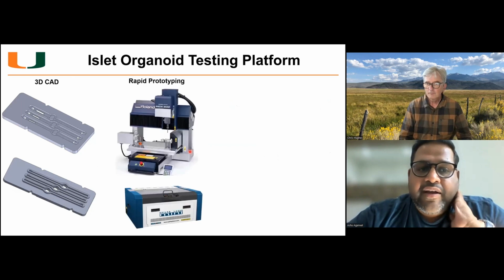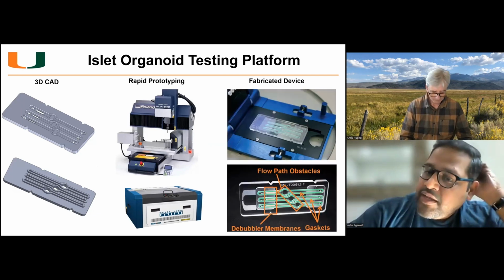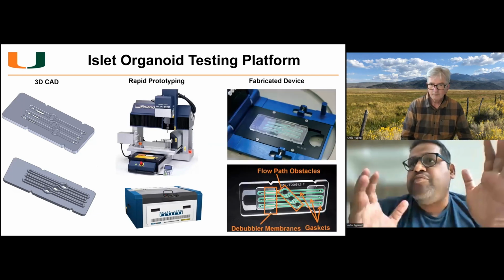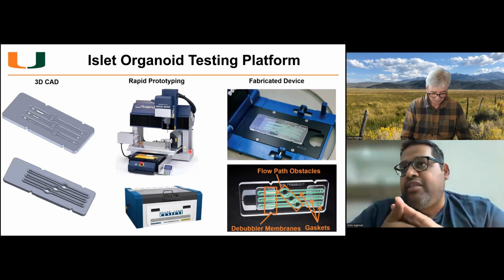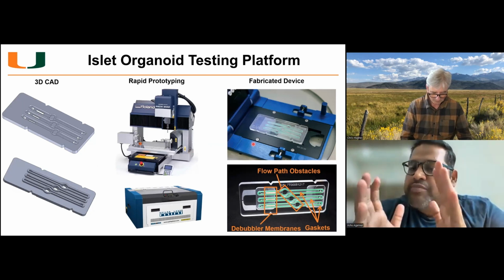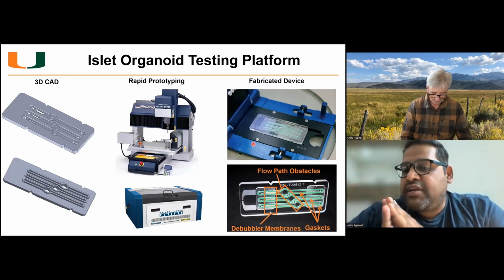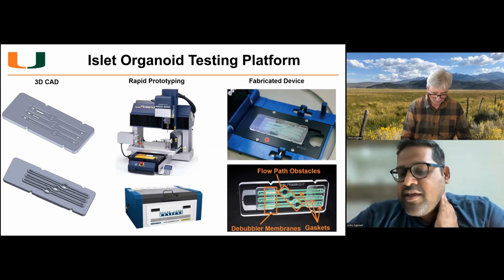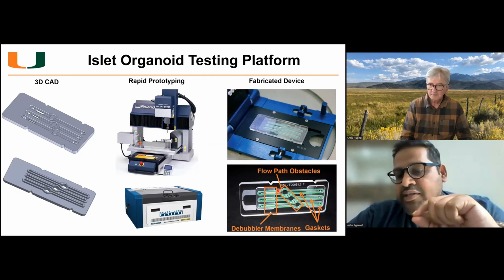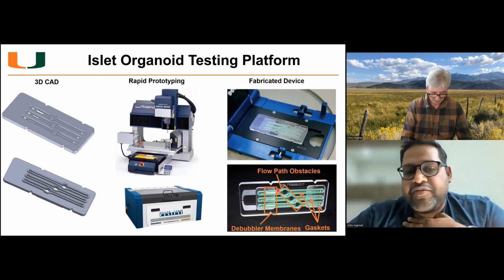So we make our devices outside the clean room through machining in inert plastics, such as acrylic. And then these acrylic pieces have to be physically, through a mechanical force, clamped together to force a fluidic seal. The clamping happens using a mechanical clamp, this blue clamp that you see, that brings these two interlocking pieces that we've machined together. And in between these two interlocking pieces sit custom-made rubber gaskets, which are these green elements, which are the only compressible units in the whole system. And once there's a mechanical pressure, these compressible units will create independent, in this chip, N of 3.